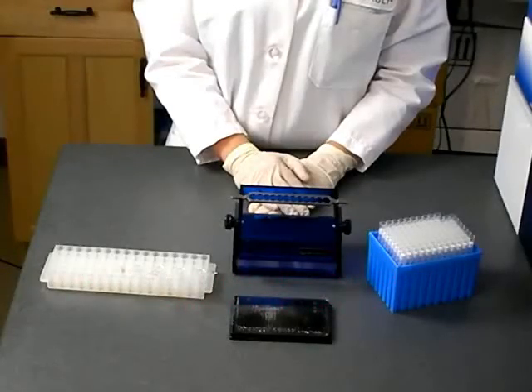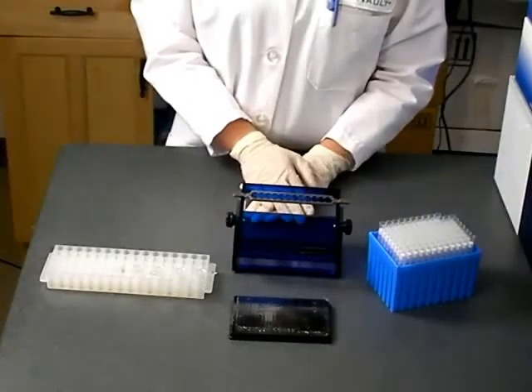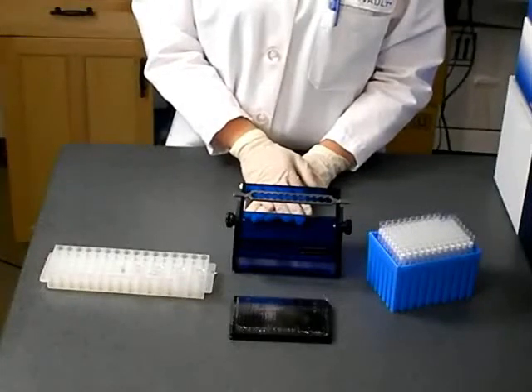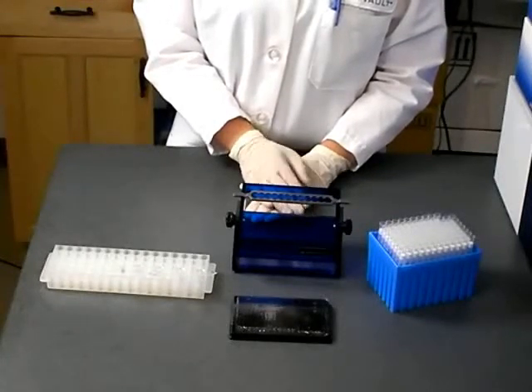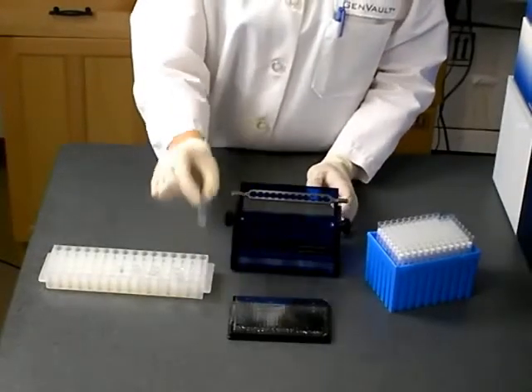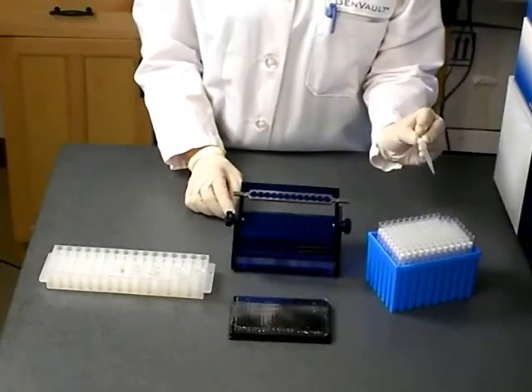Recovery of GenPlate elements for DNA recovery can be done simply with the Gen Punch, by punching out the disc of the GenPlate through the pierceable bottom and top seals. To perform this procedure, you will need a Gen Punch and a 2ml snap cap tube for each element you wish to recover. Label the tubes to keep track of your samples.